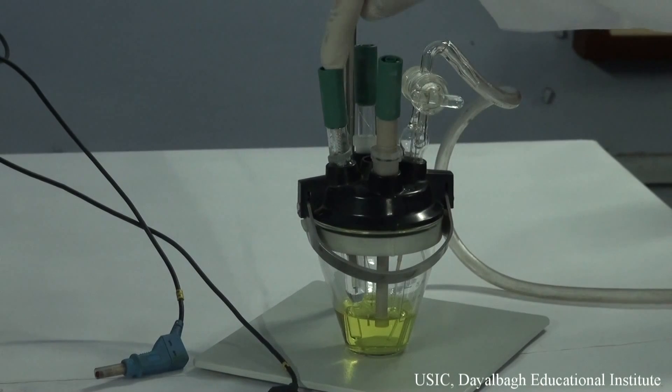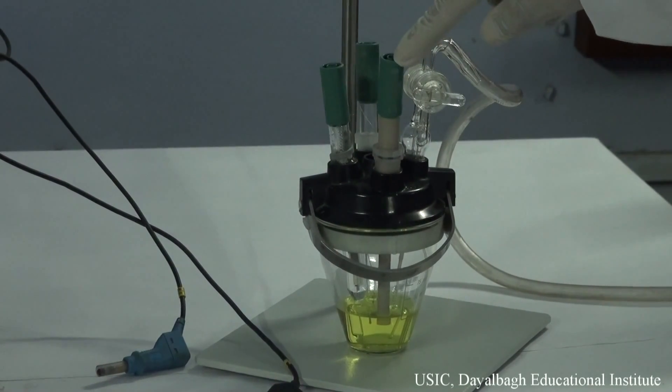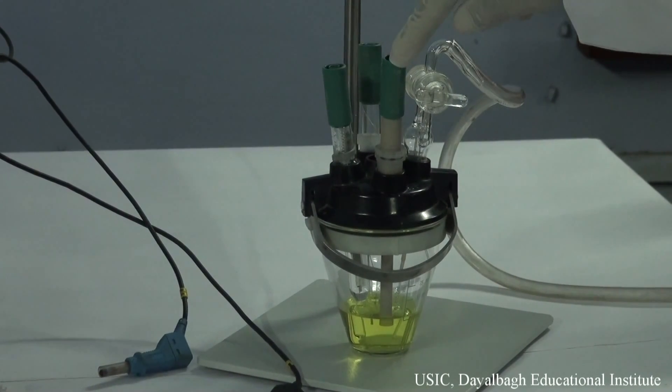Now this reference electrode, which is silver-silver chloride electrode, balances or provides the potential to the working electrode, while this counter electrode balances the current of the working electrode.